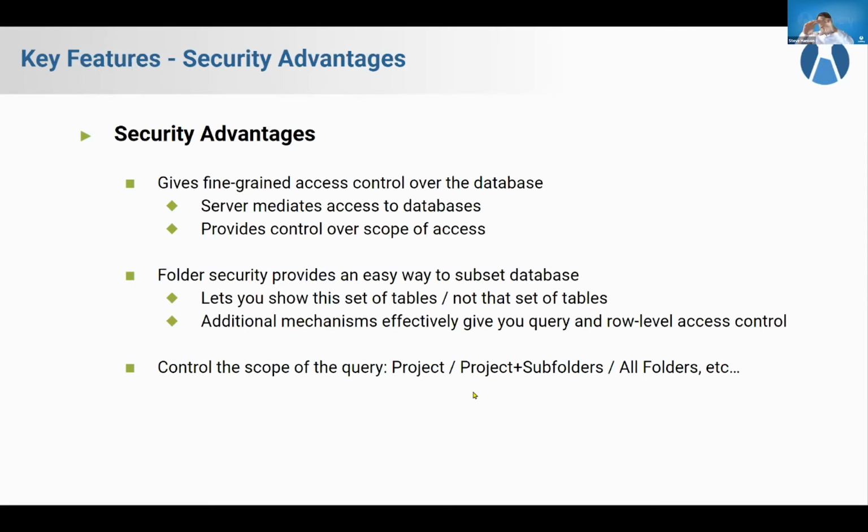Although that in itself is fairly coarse granularity, by some additional mechanisms you can achieve query level and row level access control over the database. I'm thinking here of a mechanism like a linked schema. Say in folder A, you have a large group of data that's undifferentiated and unseparated. It may be a mix of sensitive data and data that you want to show, but only to a select audience.